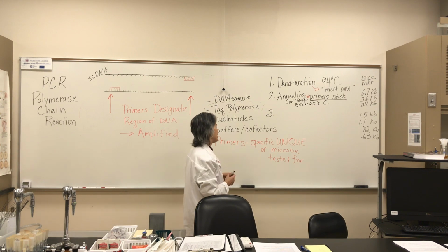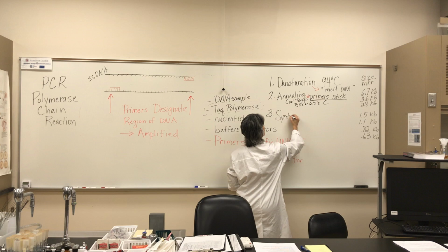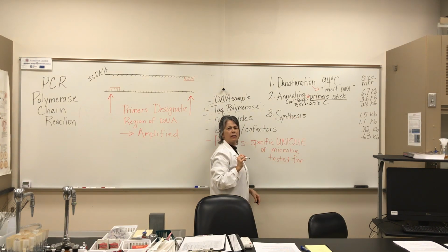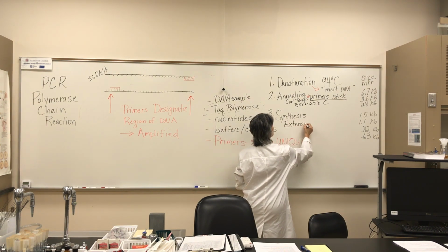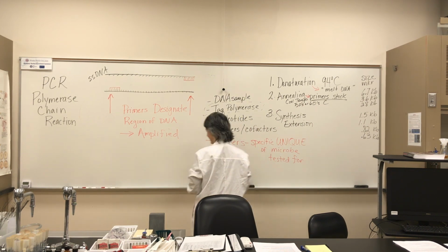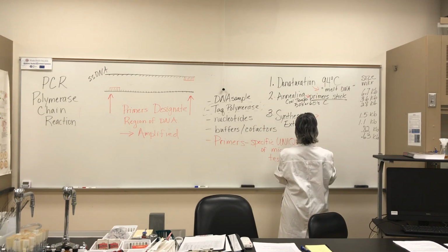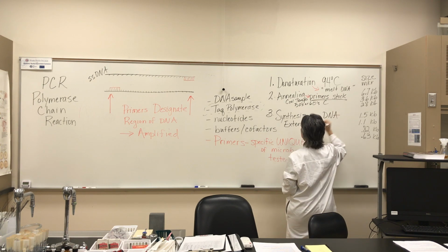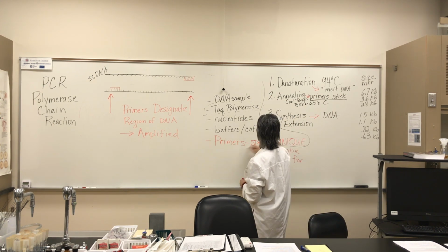Step 3, I'm going to call synthesis. There's another word, Dr. Cheney. Extension. Let's get extension up here too. What's being synthesized? What's being synthesized is DNA, right? What's the enzyme we've got in our tube? All this stuff is in our tube.